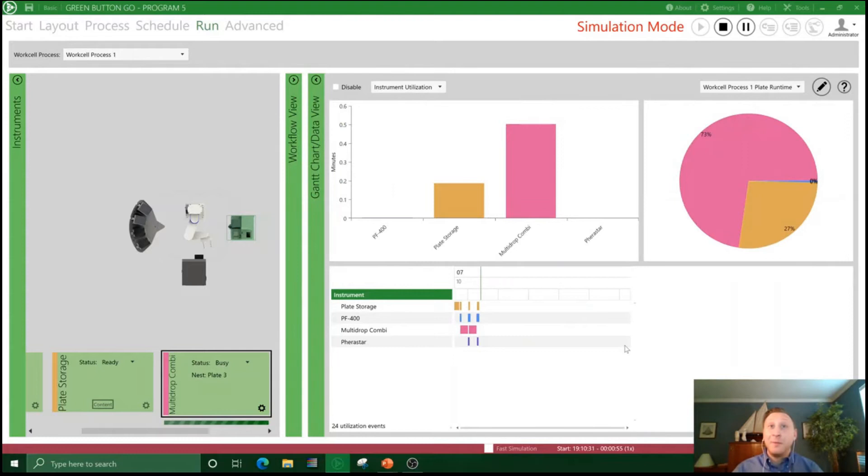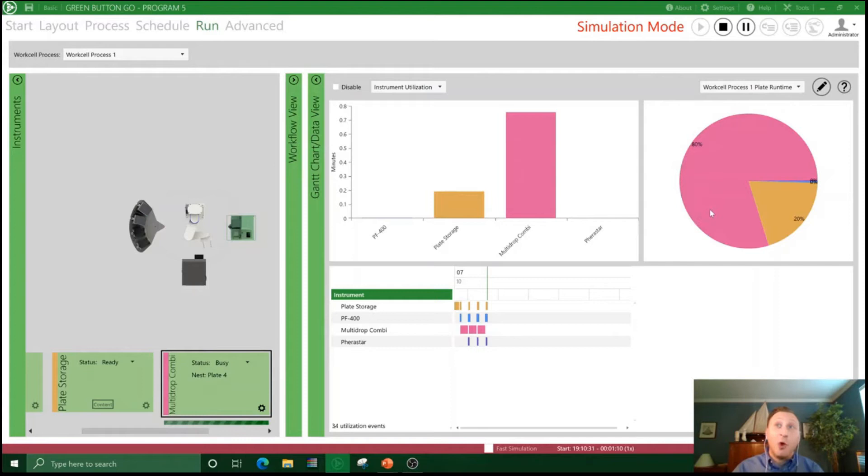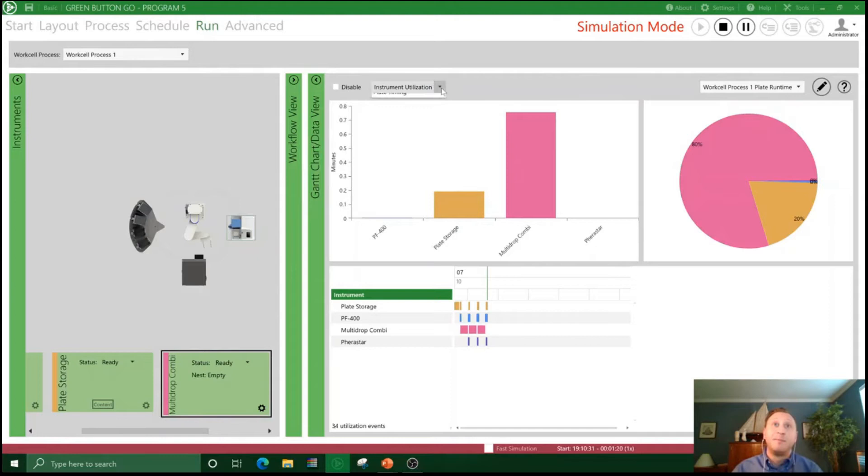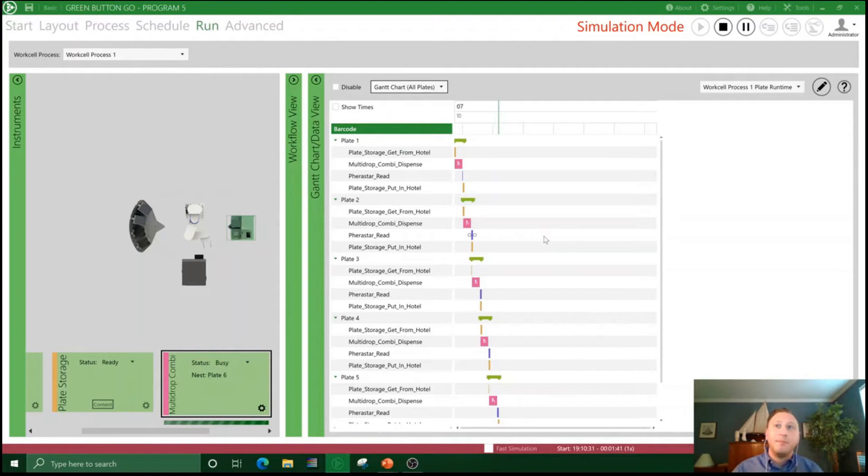And then finally, we have the data view. First up is the instrument utilization. And we can see right now that plates are spending an average of 73% of their time on a Multi-drop Combi. If throughput is a concern, maybe we want to add a second Combi for redundancy. Or maybe that's exactly what we'd expect. The instrument utilization gives you a really nice, high level, quick and easy way to see where your samples are spending time on the system. We also have available a live Gantt chart view, which shows you which plates are currently on the system, what's already been run on the system, and what's going to be run on the system.